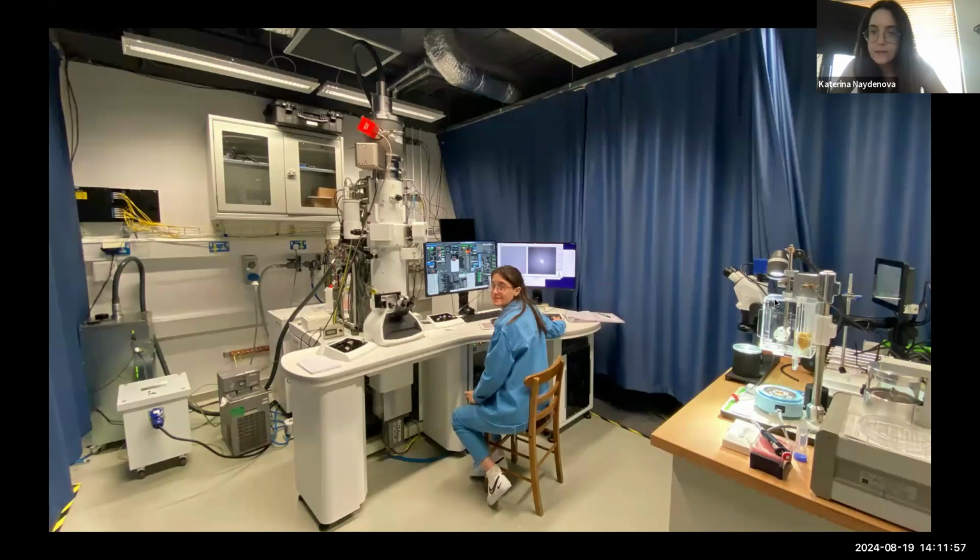For example, here on the side, you can see this chamber with the blue box. It's actually a manual plunger for freezing grids, which is also built in-house by our mechanical workshop, but the drawings for these are available, and there are drawings available from others as well, as well as a cryostat for the plunger. So you could, in principle, have all of this equipment, your sample preparation, glow discharge, plunger, and microscope, in one room, and have your sample preparation and screening right next to each other, which is really convenient and makes things fast. And also all of these things are individually much cheaper than the top-end commercial equipment.